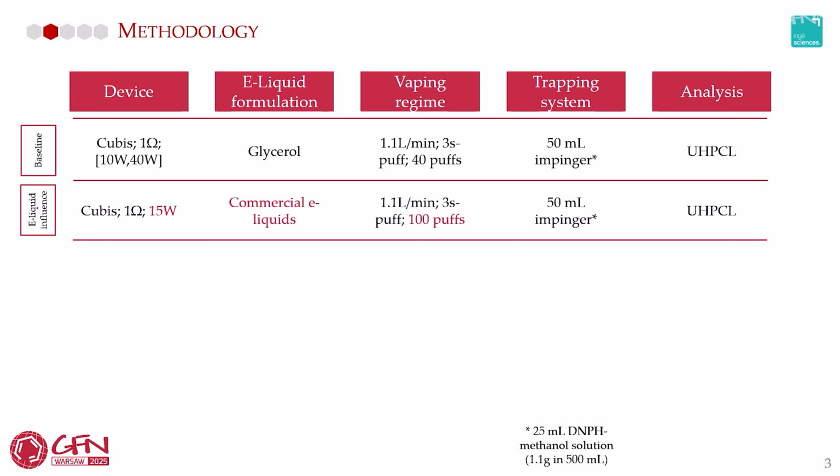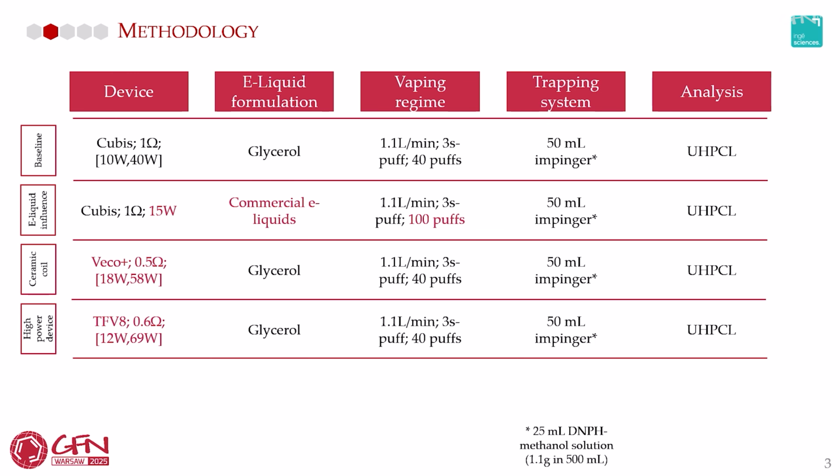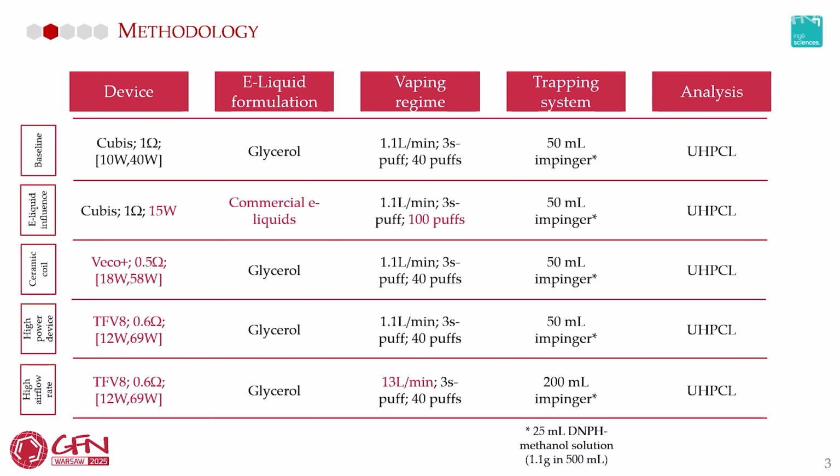1,100 commercial liquids analyzed for TPD compliance, implying the use of a fixed power. Then we used different atomizers to evaluate the impact of ceramic coil or high power device coupled with high airflow rate. Aldehydes were trapped on DNPH solution and analyzed by chromatography.